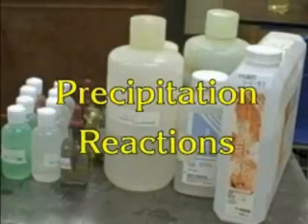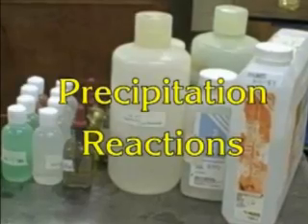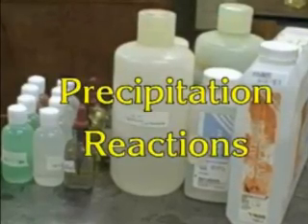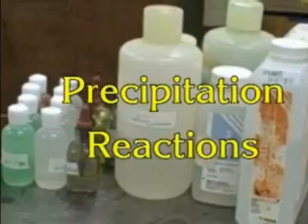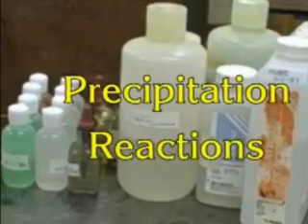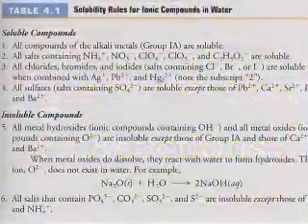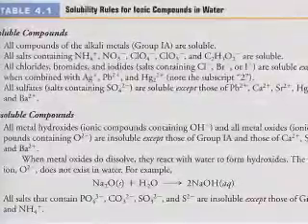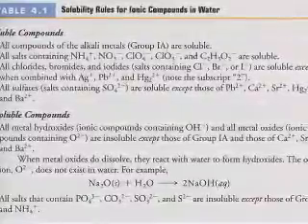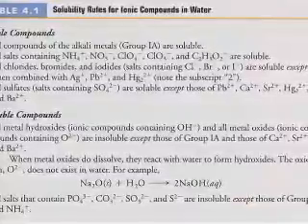All right, so in this video we're going to present some precipitate reactions, get you more familiar with precipitation reactions and what occurs in them. On page 147 in our book, we have the solubility rules, table 4.1, explaining the different kinds of solubility products, or the materials that will not be soluble in aqueous solutions.